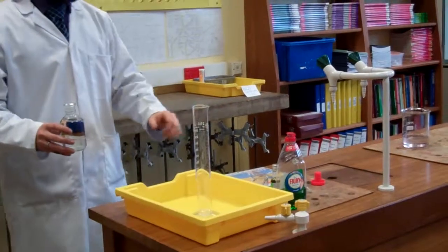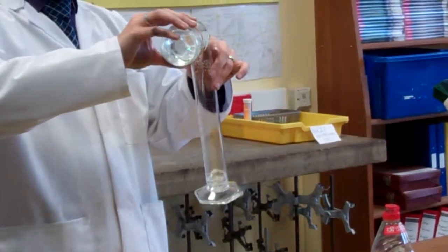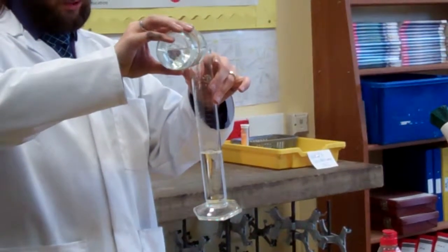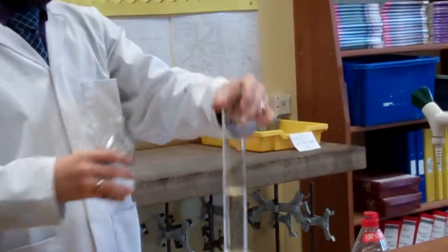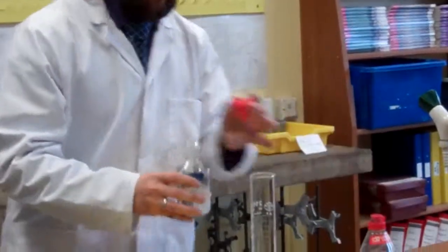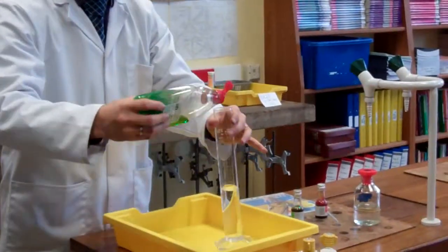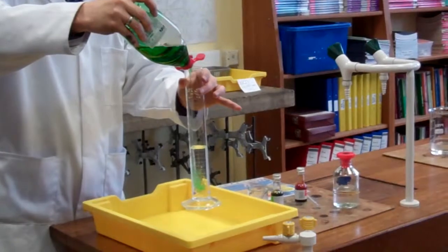It's quite warm in here, which will help the yeast a little. What I'm doing is I'm putting hydrogen peroxide into this measuring cylinder. I'll put about 120 to 130 millilitres in. There we go. So we put that in, and we can add washing up liquid. What this washing up liquid will do is it will help to trap any bubbles.